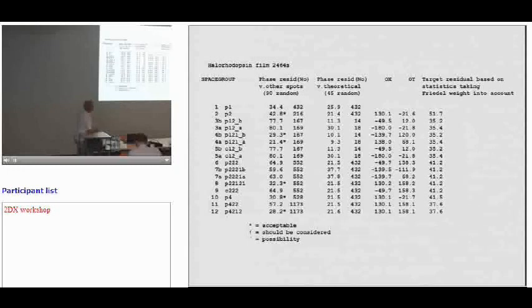That's better than you expect from the signal-to-noise ratio. And then, of course, all subsymmetries also work, because P4212 has a 4-fold axis, so it is equally compatible with P4, or with P121, and so on. So you get the symmetry and all the subsymmetries. Because you've carried through this signal-to-noise ratio, if this number is less than that number, the space group must be that symmetry.